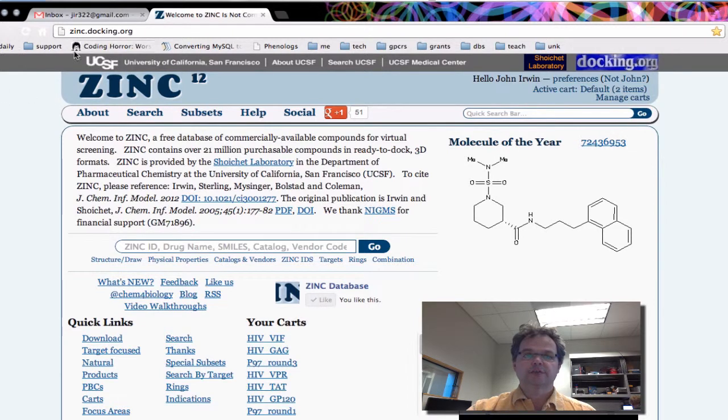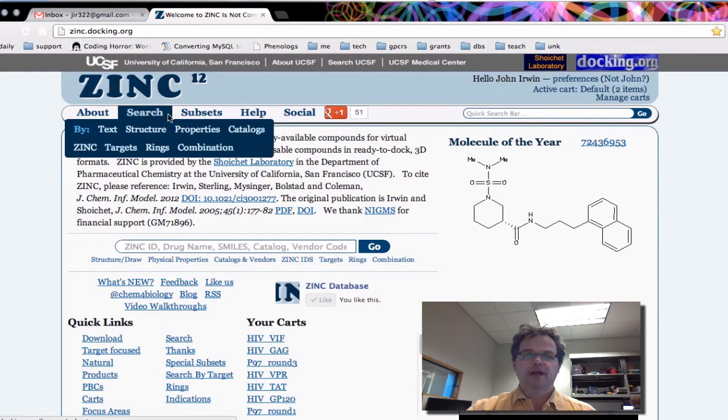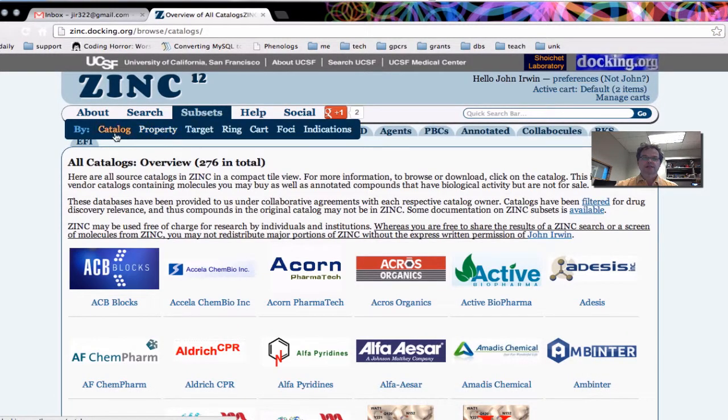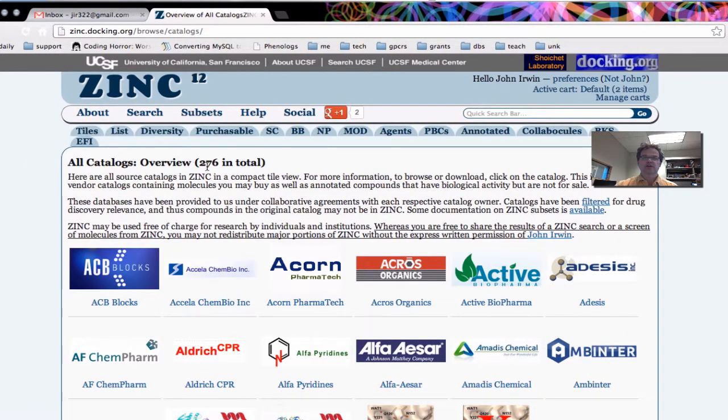So here's ZINC, zinc.docking.org. And I'll just remind you that you can see all the catalogs in ZINC by going to Subsets, Catalog. And you can see that there's 276 catalogs currently in ZINC.